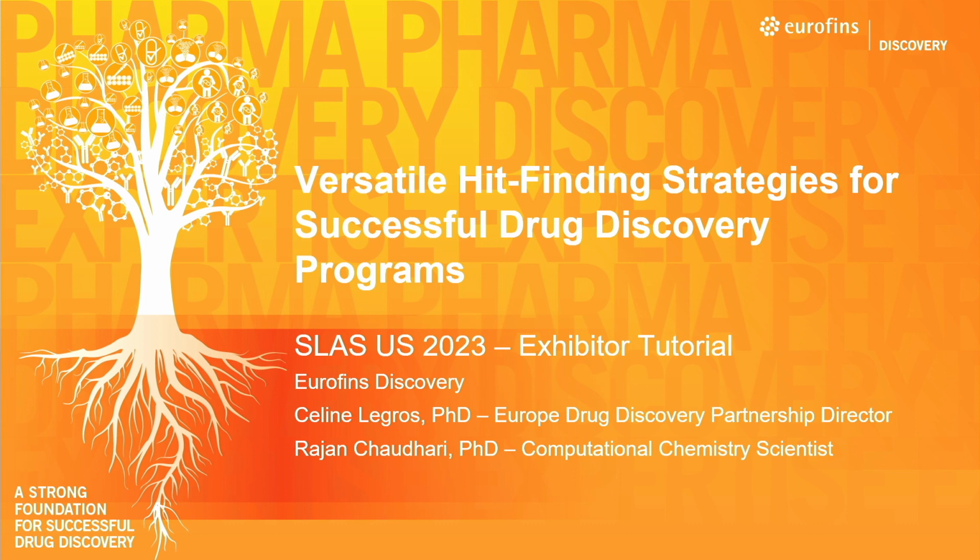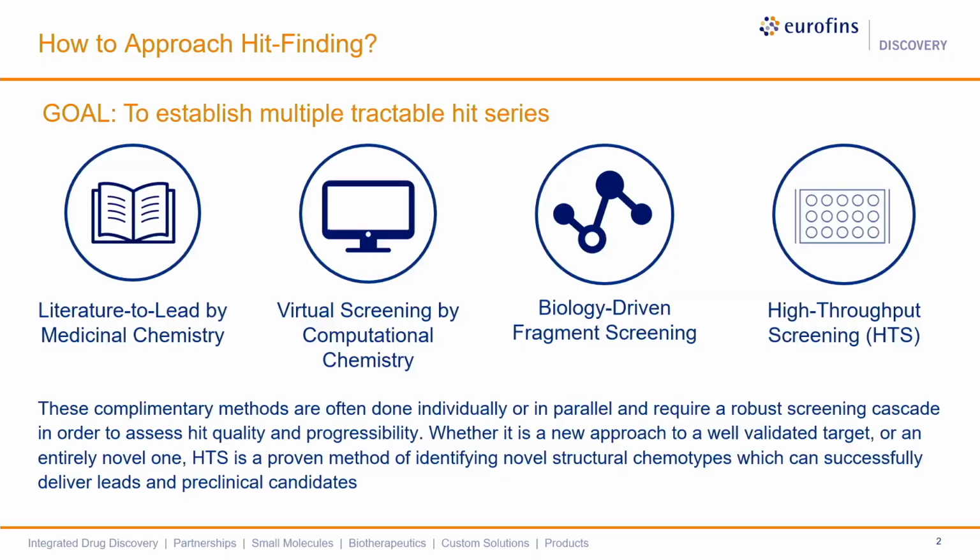We are pleased to present you our data around a versatile hit finding strategy to address drug discovery programs. So let's start. How can we approach hit finding? There are several approaches we can use to answer this question and find attractive hits to initiate successful hit-to-lead programs.